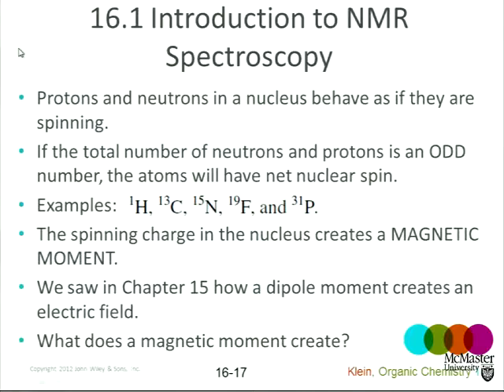But we can do NMR on a variety of rare nuclei. Nitrogen-14 has no spin. That's the main isotope of nitrogen. But N15 does. That's heavy nitrogen. Fluorine is fluorine-19, right? It's got an odd number of neutrons plus protons. It's got spin. Phosphorus-31 is a very useful nucleus to study if you're interested in biological processes, right? ATP has 3 different phosphorus nuclei. You can actually measure ATP in real time in cells, by taking a person, a student, whatever, and sticking them in the NMR spectrometer. And of course, whole body magnetic resonance imaging is based on putting you in an NMR spectrometer, and we'll talk about that towards the very end.